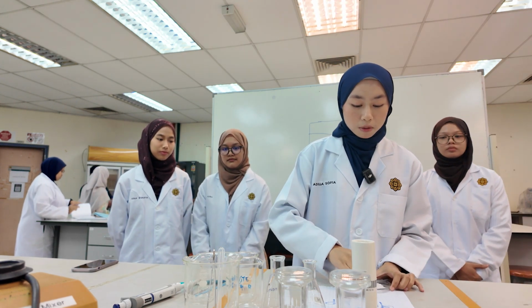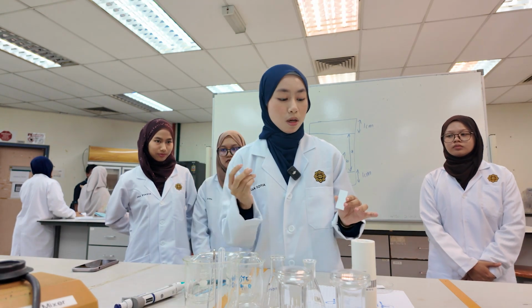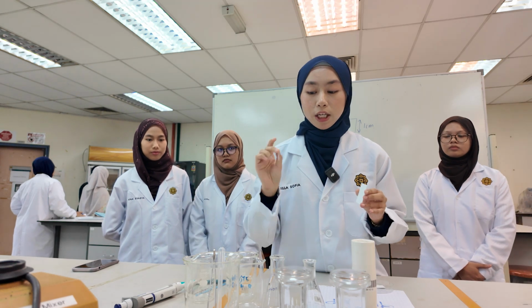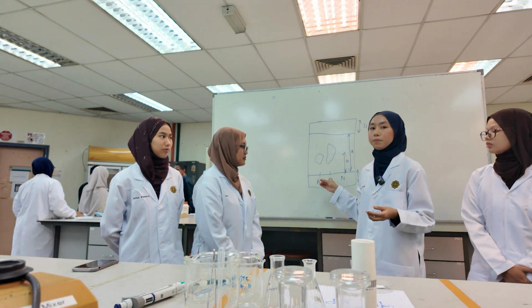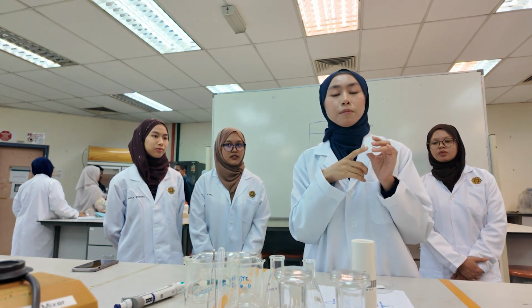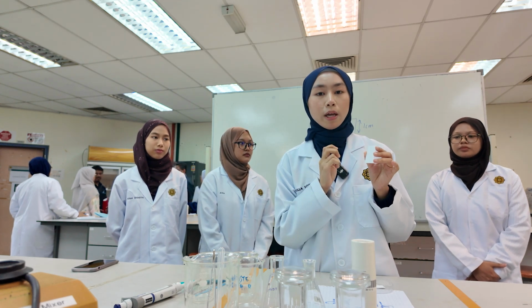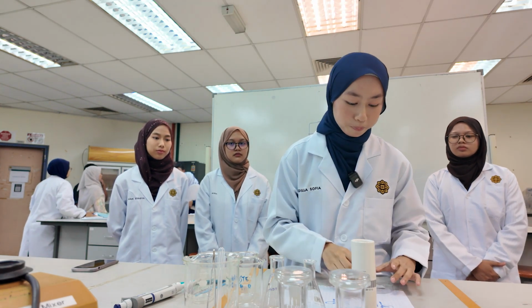Using capillary tubes, spot 1 drop of each sample, which are again A for acid, B for base, and N for the neutral, along the baseline, and make sure that the spots are small and apart from each other to avoid overlapping.